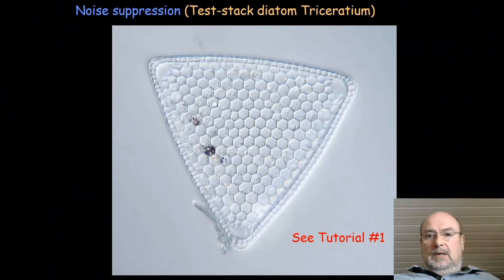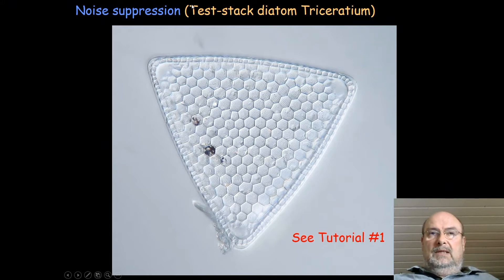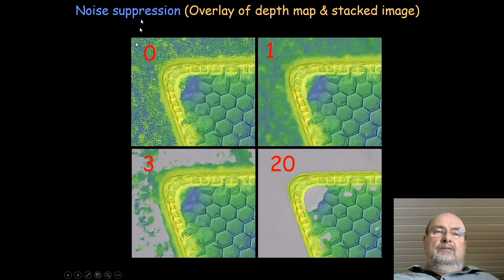I'm showing my examples on this little diatom which can be downloaded from the Picolet tutorial site, or it's installed if you use the installer. There's another tutorial number one which shows the stacking of this diatom. We have areas with nothing, areas with fine structures, and larger structures as well. We'll see how to find the parameters to get a good stacking result.